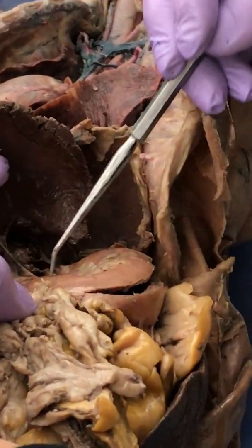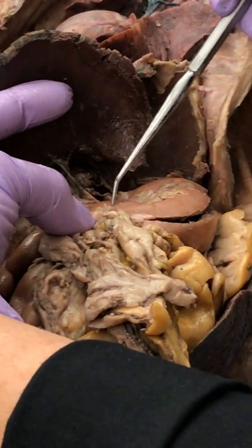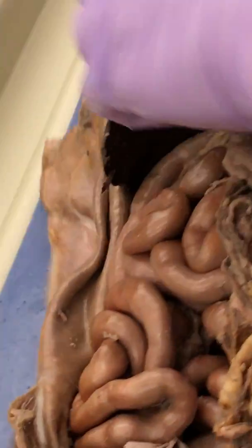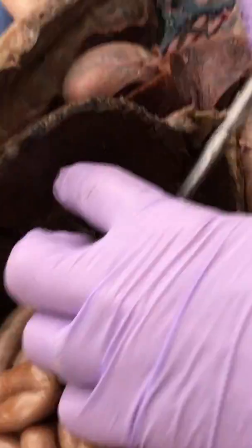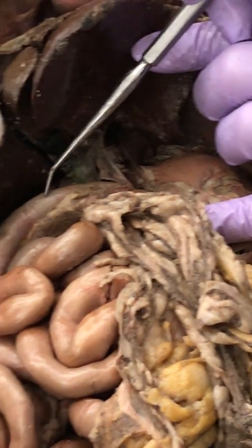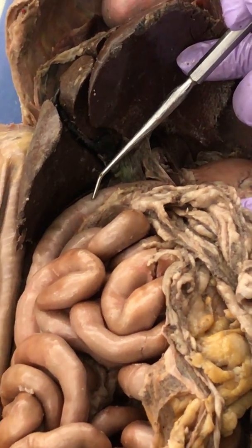What region of the stomach is this? Oh, okay. The top's the fundus, the bottom is the pylorus. Good, and you can see it constrict. There would be a sphincter there. See it constrict right there? So that's the end of the stomach. So what would this be? That is the duodenum.